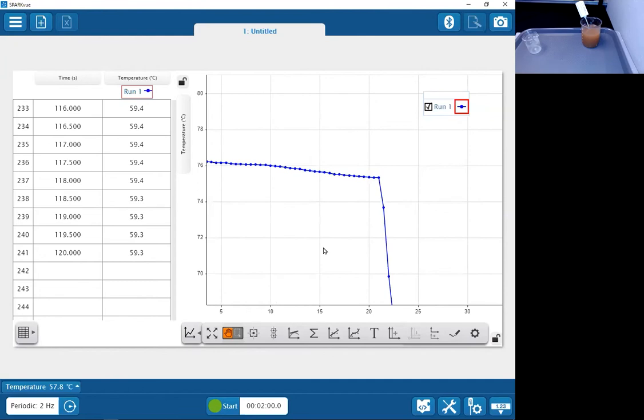So if I'm looking at this cusp and I want to remember a week from now what happened there, it would be nice to be able to add a label. So with the graph toolbar open, I can see that there are some tools here. And if I have a mouse-driven device like this Windows computer, I can hover over a particular tool and it tells me what the tooltip is for that.